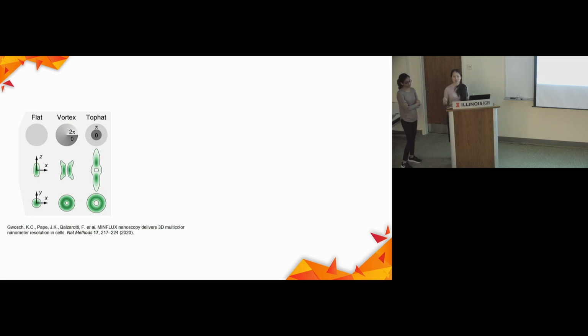It's in the nanomolar range. You will not be able to see it from the eyepiece. That's why we co-microinject the green one. But the green will give you background. So it would be ideal, and we're going to do that in the future, if we don't microinject green at all. We just have the red, and we look at the bright field to see where the cell is located. And then we just image the red channel. So you will still have two channels, but one is bright field, one is red channel.